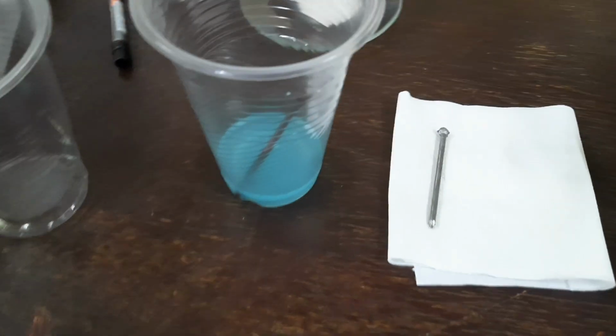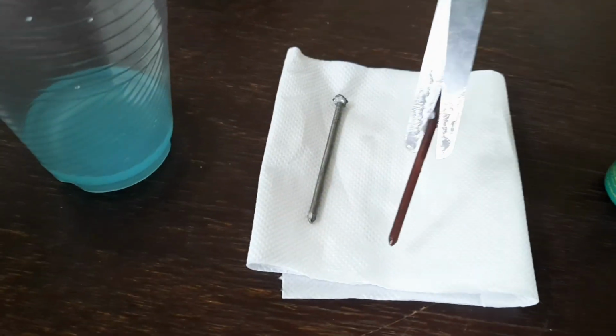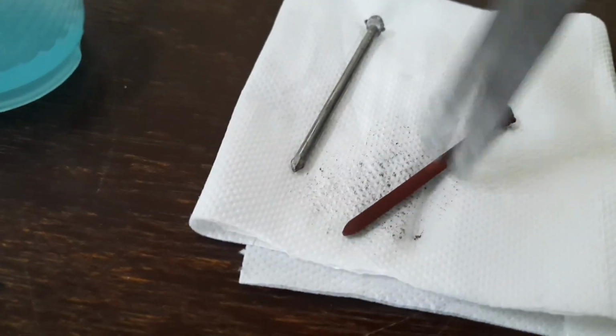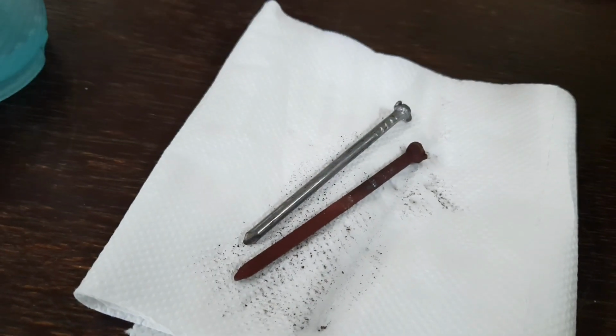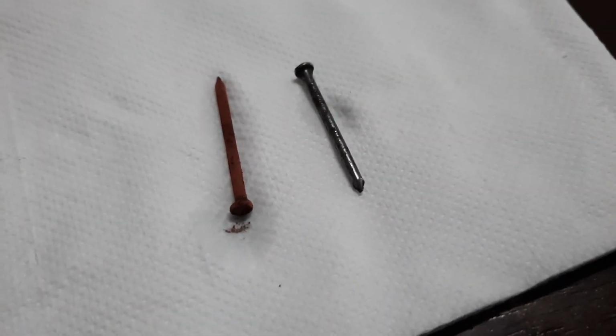When iron nails are put into copper sulfate solution, the blue color of copper sulfate solution fades gradually and red-brown copper metal is formed. Iron nail is Fe and blue copper sulfate is CuSO4. When the nail is kept in it, iron being more reactive than copper, it displaces copper from copper sulfate and forms ferrous sulfate, which is greenish blue. And the displaced copper deposits around the nails, giving it a color of reddish brown.